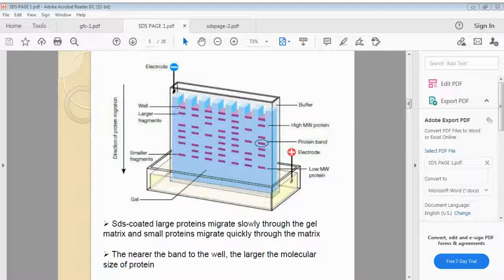So the disulfide bridges are used for the folding of the protein. When beta mercaptoethanol attacks the disulfide bridges, they will be broken and the folding of the protein will get affected. So it unfolds, and all the amino acids will be exposed.